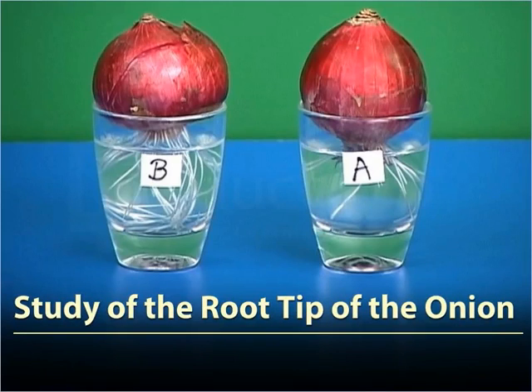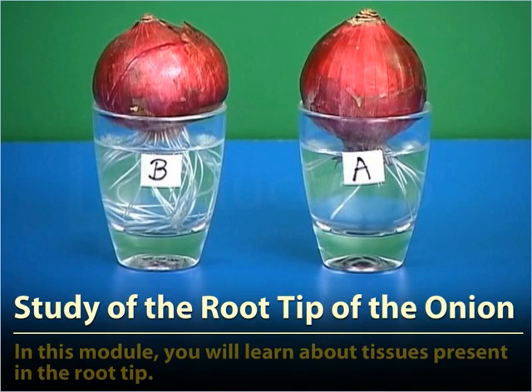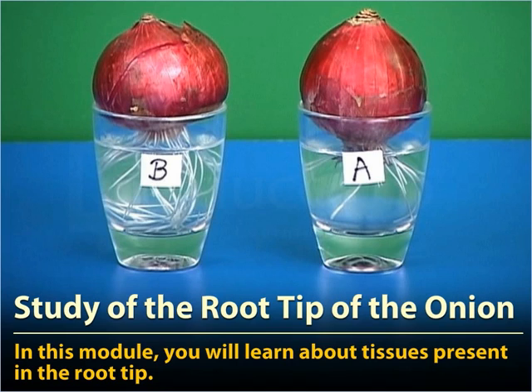Study of the root tip of the onion. In this module, you will learn about tissues present in the root tip.